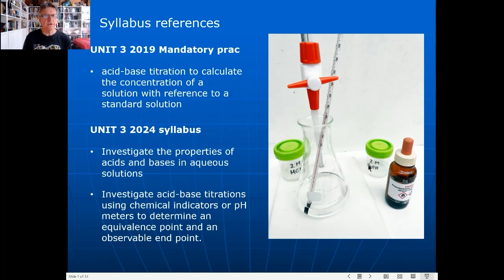Sodium hydroxide up around 3 molar is pretty dangerous, and even wearing gloves and goggles and lab coats, it's not something you really want to use too much in a senior chemistry lab. Hydrochloric's not so bad. Okay, and I've got a glass thermometer there. That's a fairly straightforward setup. You could do that with a minimal amount of equipment, cost almost nothing. People who are doing it away from a lab, you don't really need a lab for that sort of equipment.